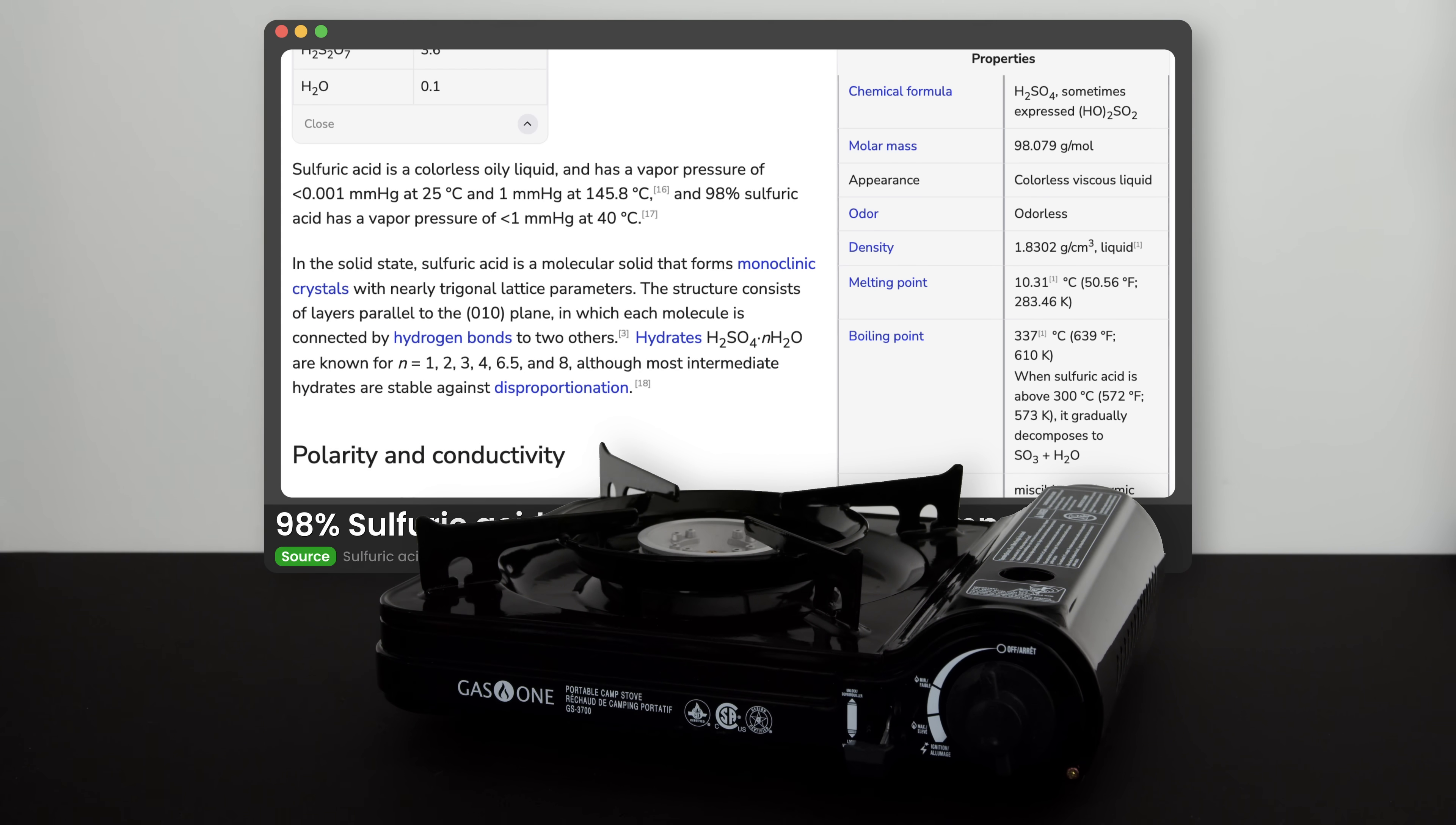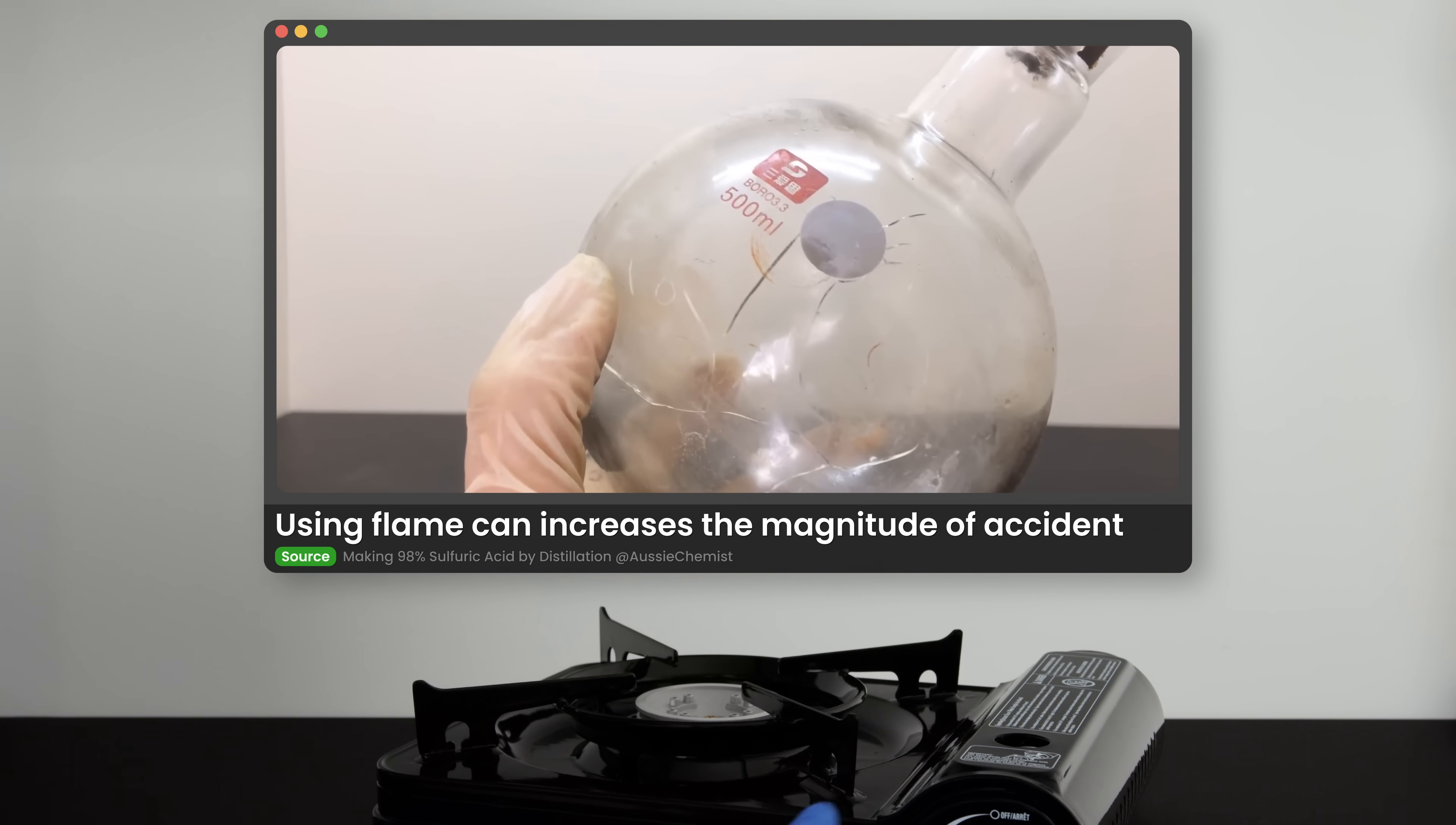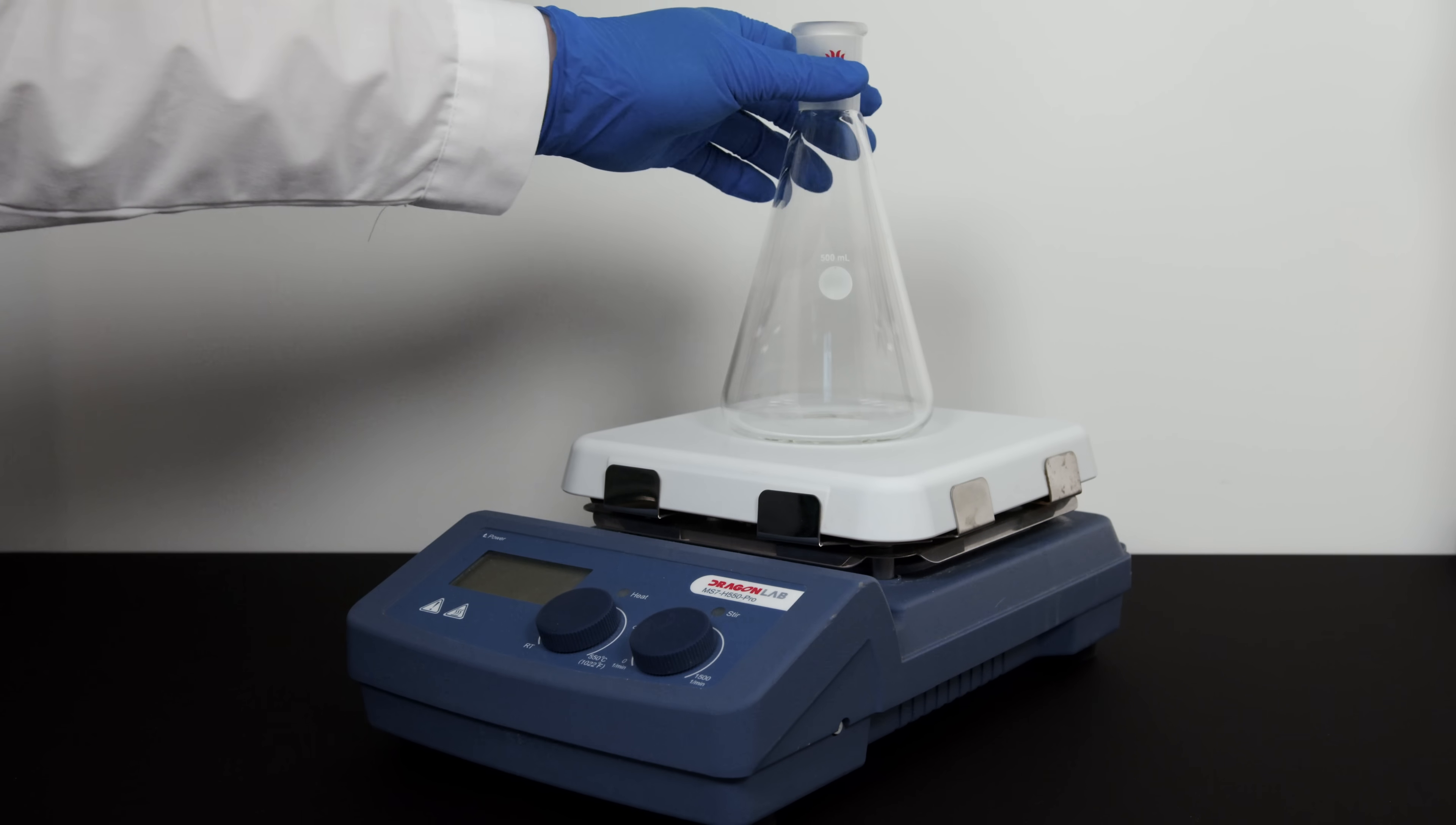So one of the logical choices that might come to your mind is using a flame to heat it. While it will work, as you can see from other videos, I am strongly against using open flame, as I am an advocate for flameless experiments. While I can't avoid using flame entirely, I prefer to use it only when it is necessary. The risk involving hot concentrated sulfuric acid would be essentially amplified to a whole new level if the flame is involved. Another solution is to use a hot plate. But only some hot plates that usually have ceramic surface are capable of delivering the heat required. Even then, you still need to modify your setup to use an Erlenmeyer flask instead of the three neck round bottom flask, which isn't ideal.